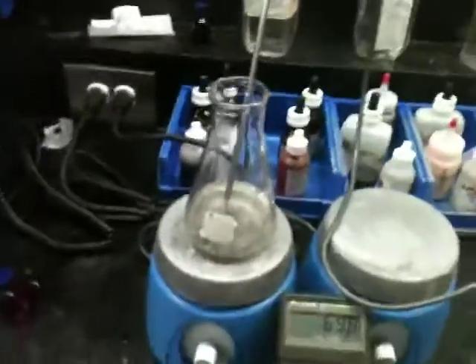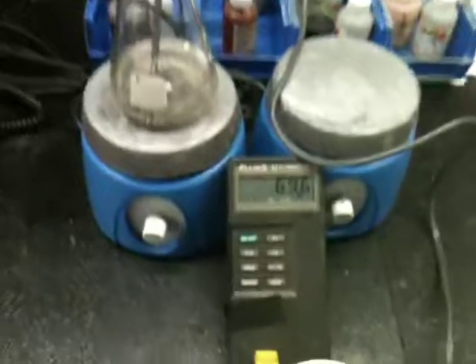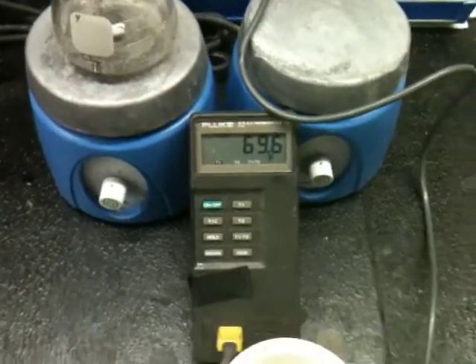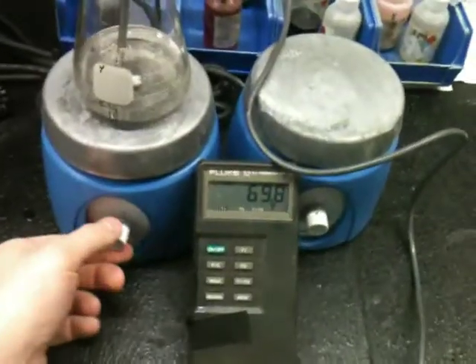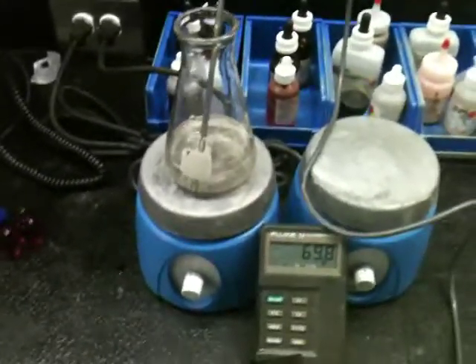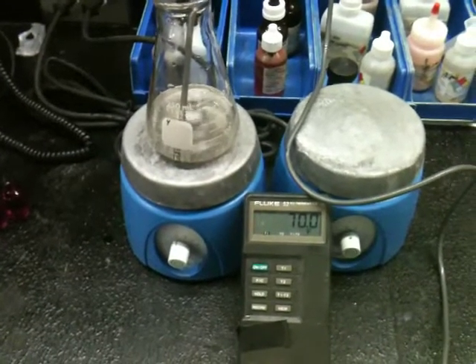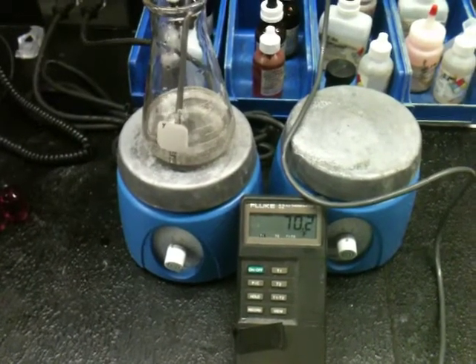All right, there's 100 milliliters of deionized water, or roughly close to it. As you can see, the temperature is at about 69.6, and at this point it's staying relatively steady.